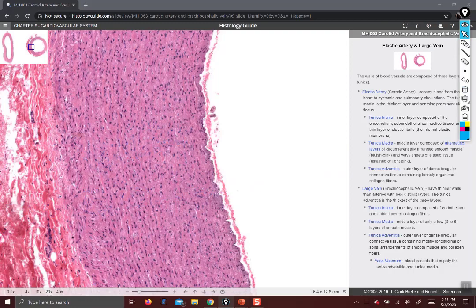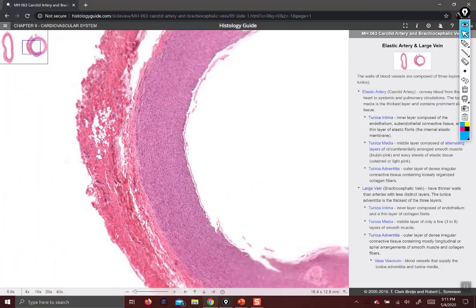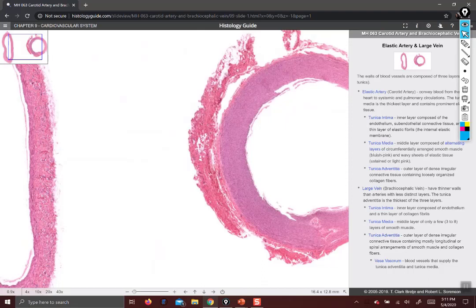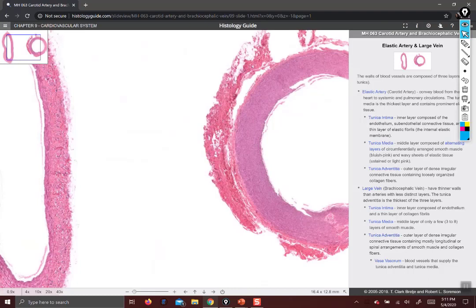Let's zoom out a little bit and compare that with the vein. Looking at the artery on the right and the vein on the left, the relative thickness of the layers is different. Veins don't have that much tunica media, and they have more tunica externa — which here they're calling the tunica adventitia. Those two terms are interchangeable. So let's zoom in on our vein.